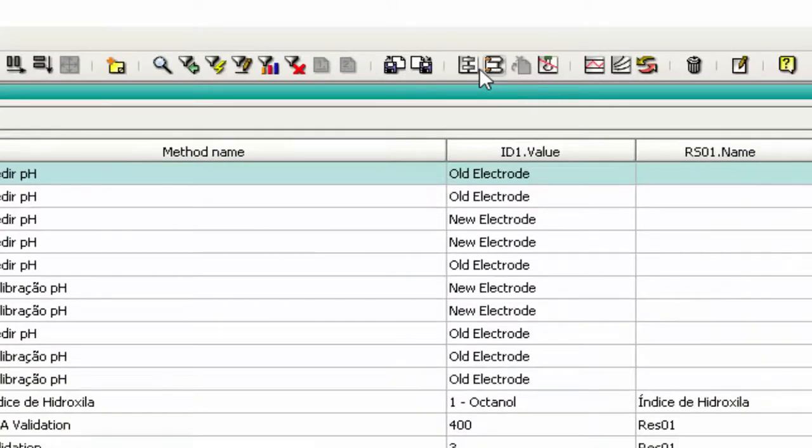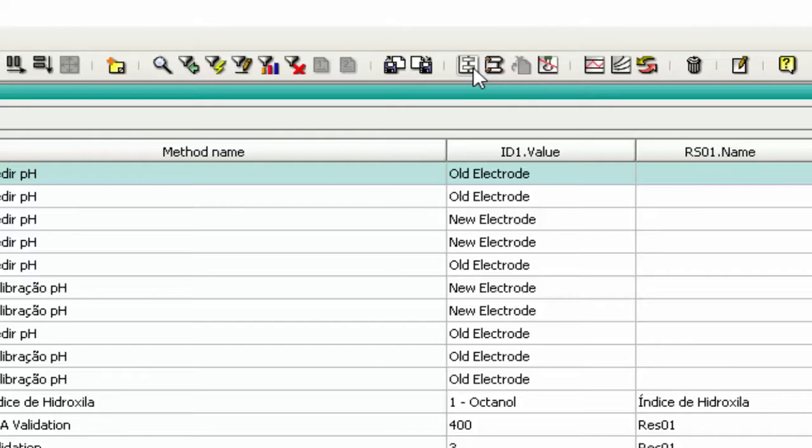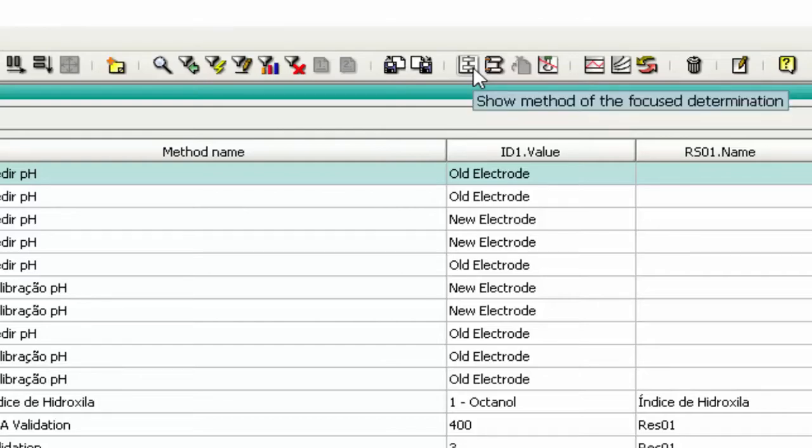If you want to see the method used in the selected determination, just click on the button 'Show Method of the Focus Determination'.